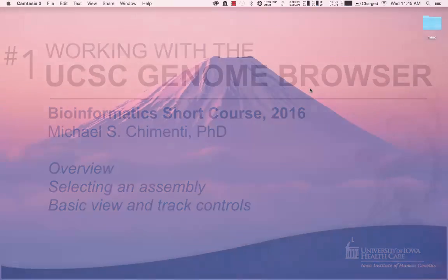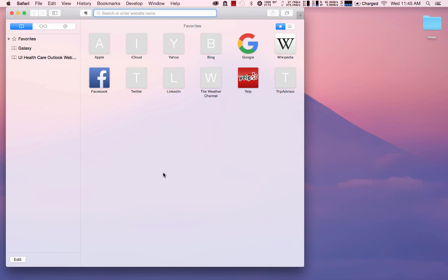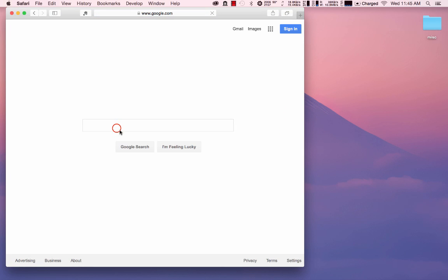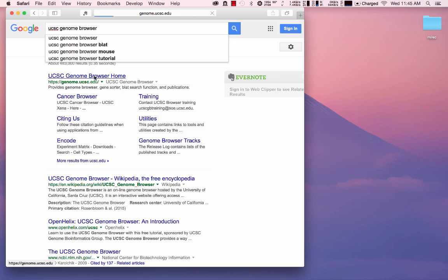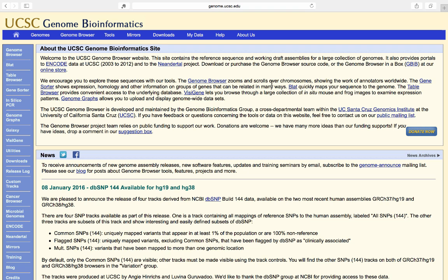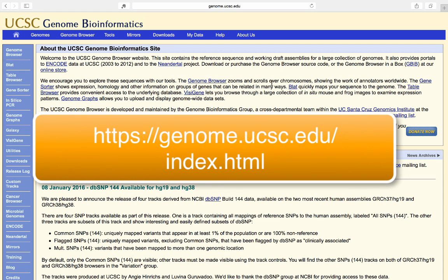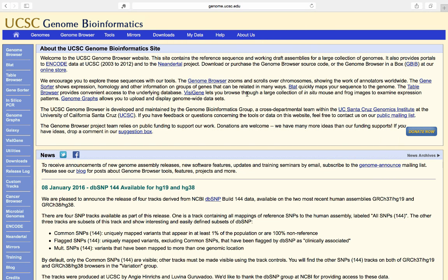The first thing to do is open a browser and go to Google. I'll open a Safari window and type in UCSC Genome Browser. You can see that the result you want is the first result, so we just click on that. Alternatively, you could type the URL directly: https://genome.ucsc.edu/index.html. This takes you to the UCSC Genome Bioinformatics homepage.